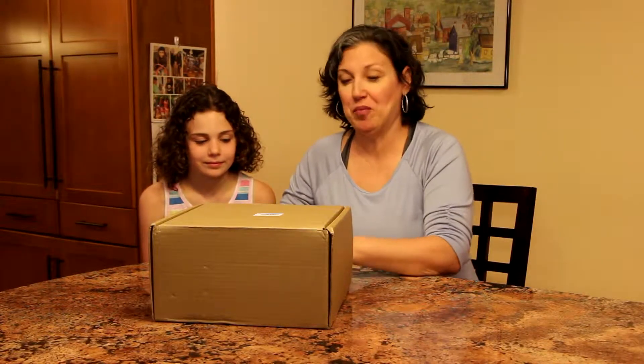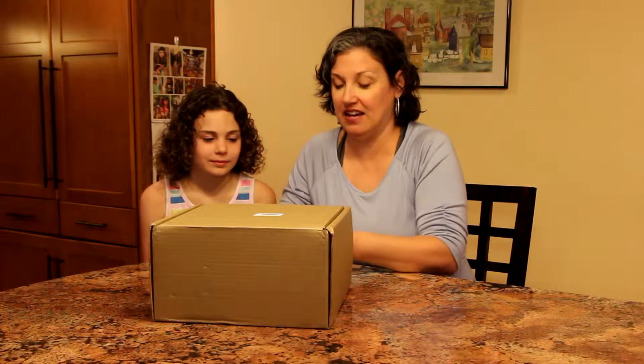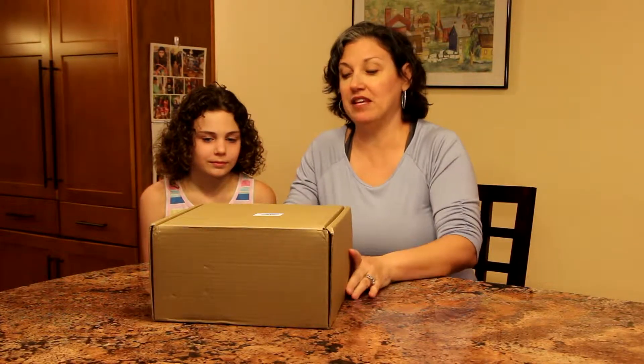Today we're going to unbox the MEL Science Starter Chemistry Kit. So let's go ahead and open up the box. It just comes in a plain brown box from the post office.